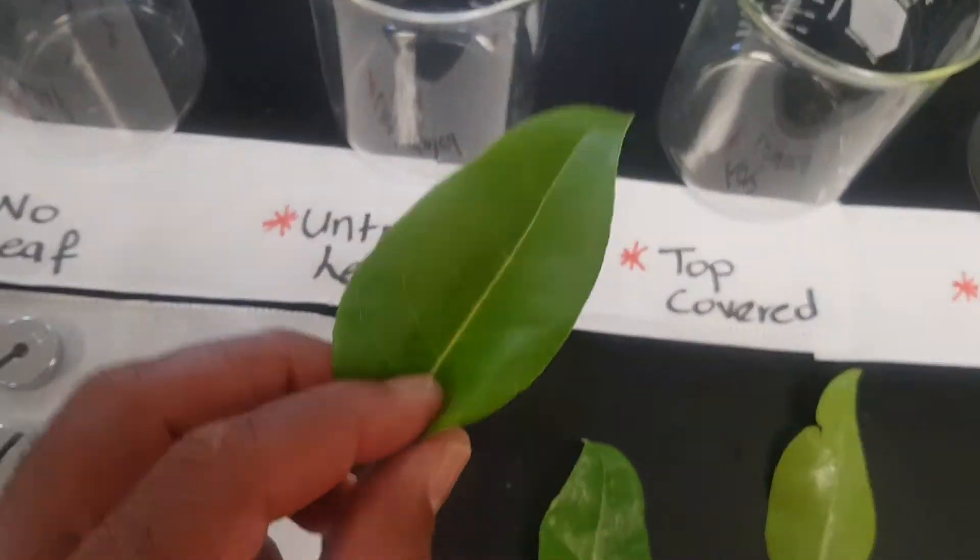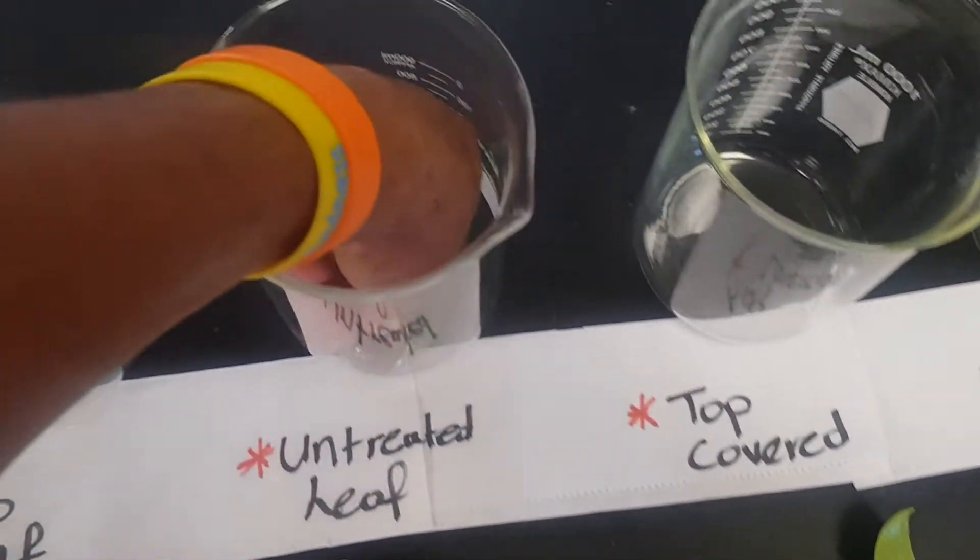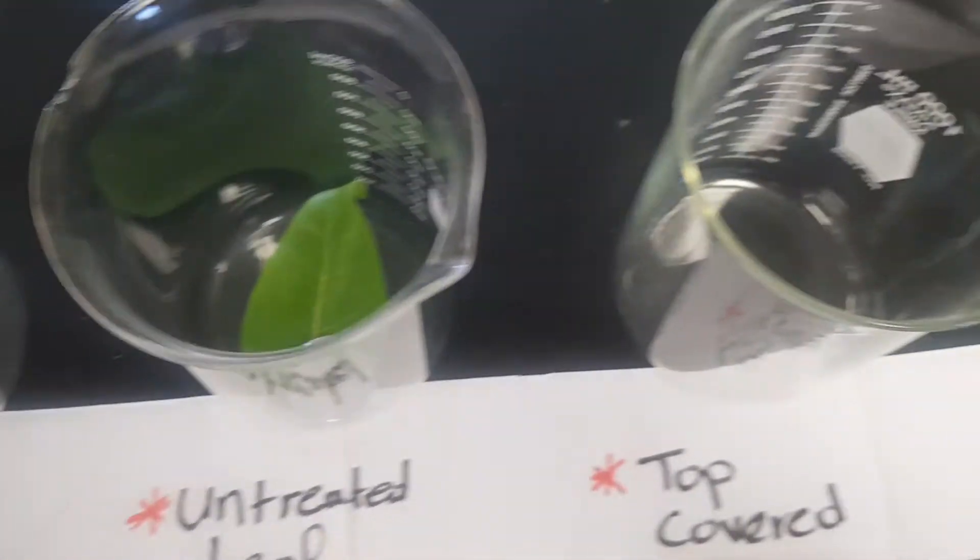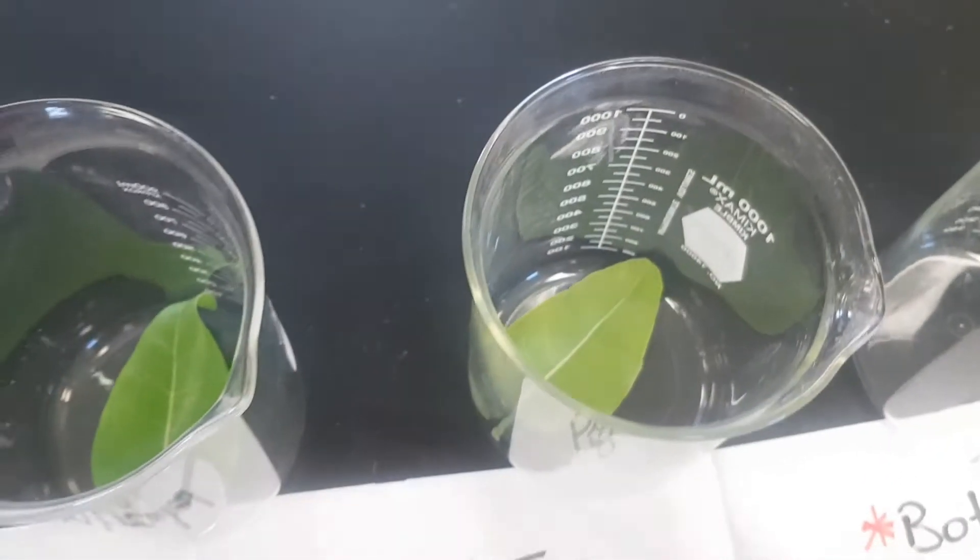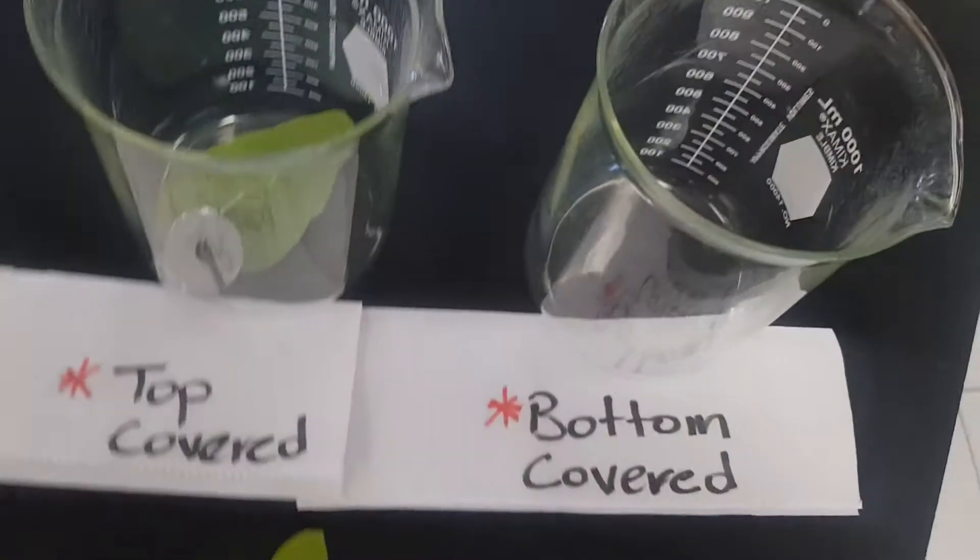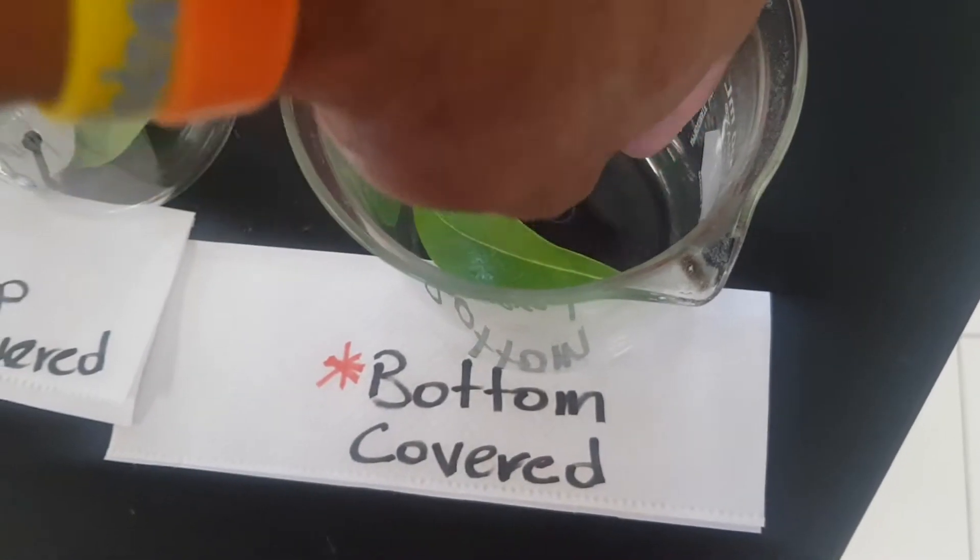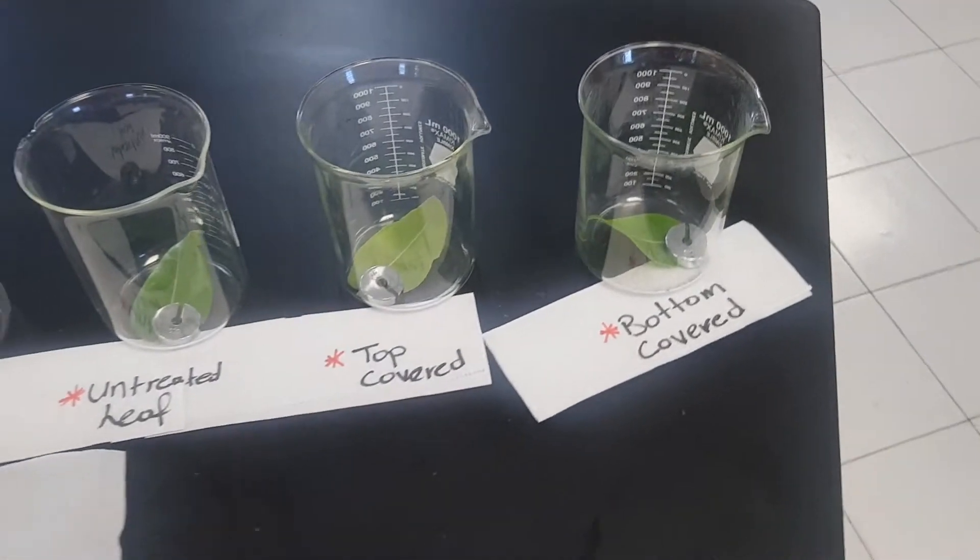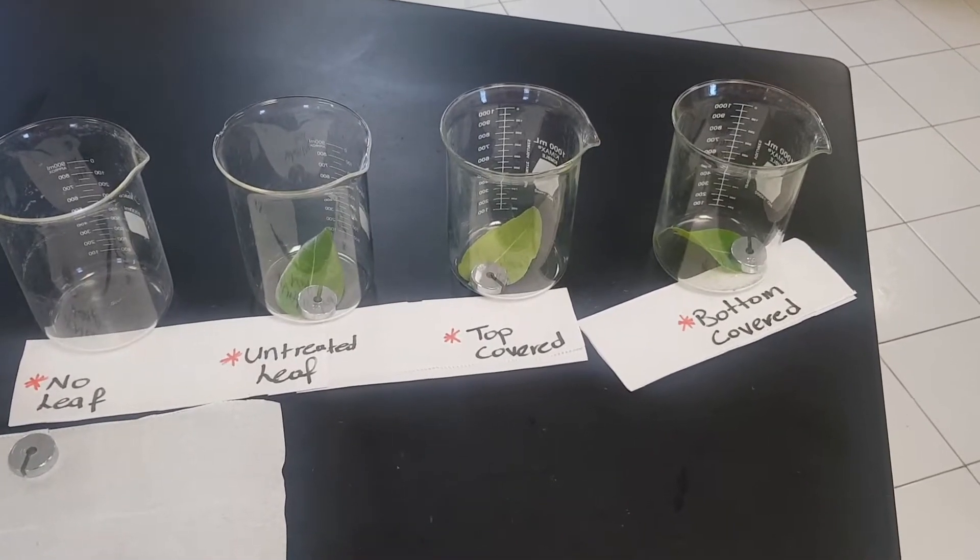To prevent any floating of the leaves, we're going to put the leaves in the beaker and then secure it with a weight. Let's put this on the bottom. Let's secure this with a weight as well. Now the leaves are being secured with weights to the bottom of the beaker to prevent floating.